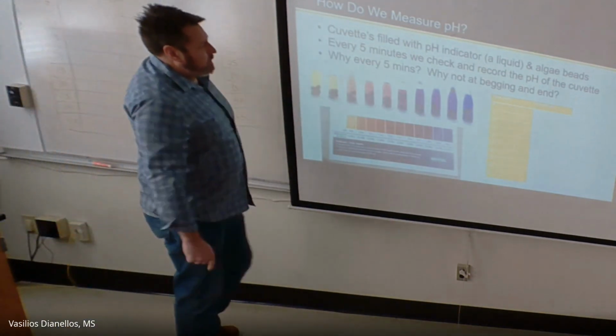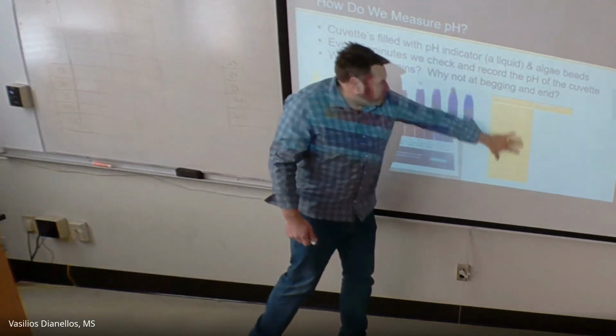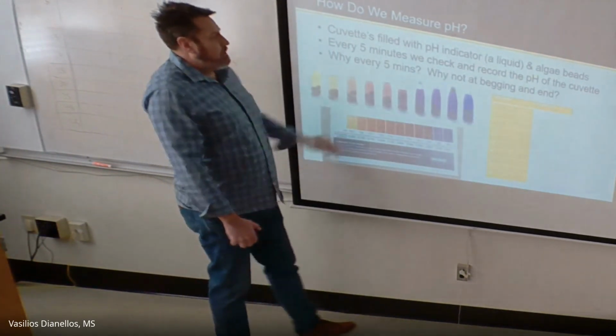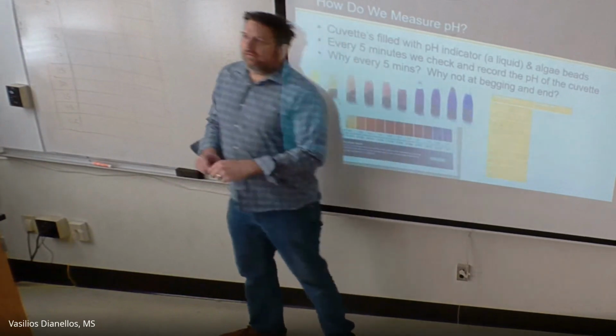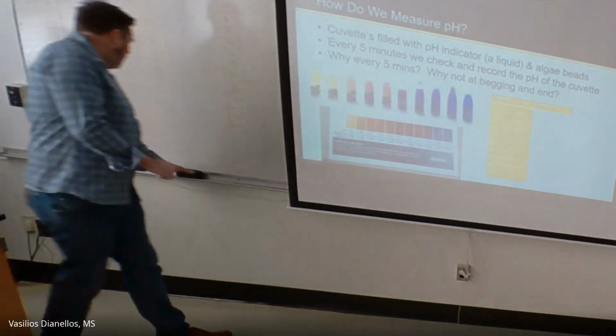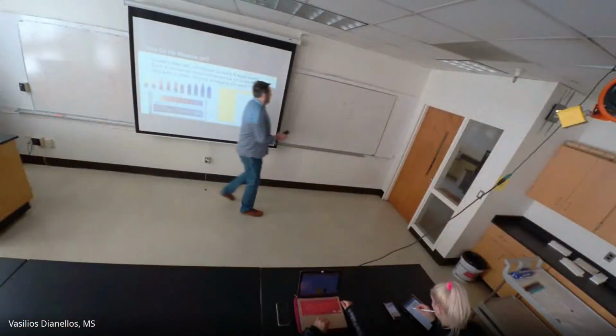You're going to put it in your table. Let me ask you this, though: why do it every 5 minutes? Why don't we just take the pH at the beginning and then take it again 45 minutes later? Why do we need it every 5 minutes? Any guesses?